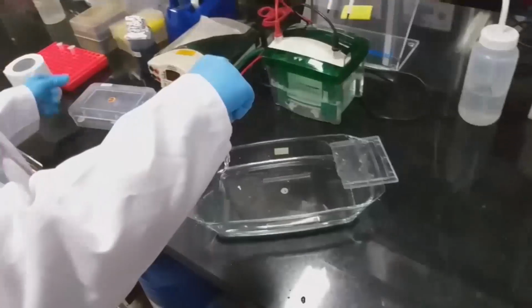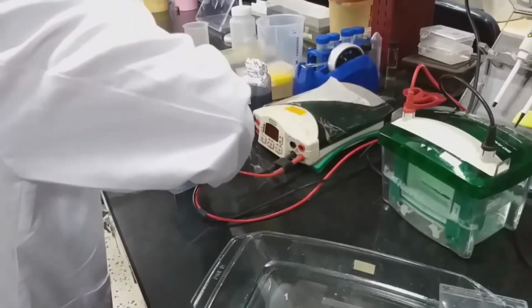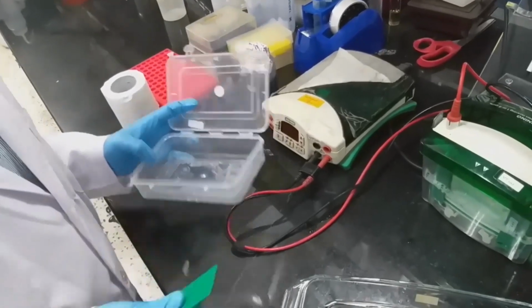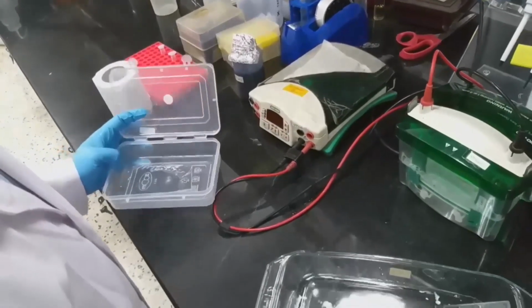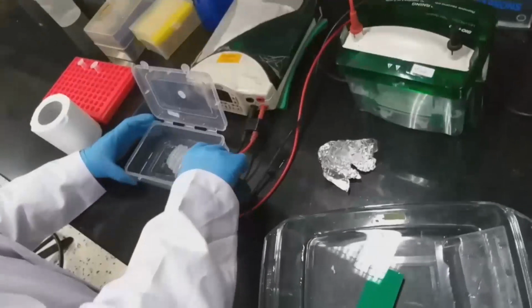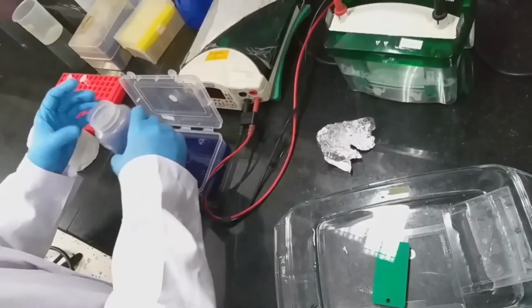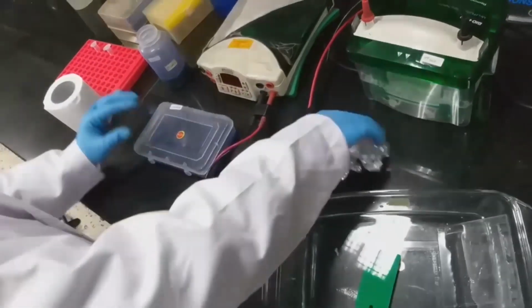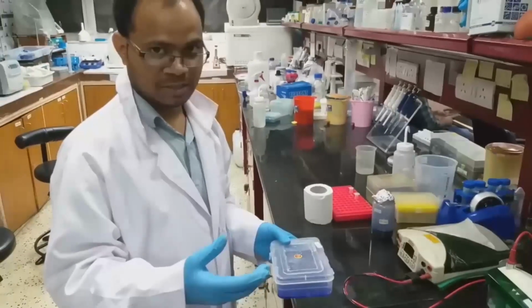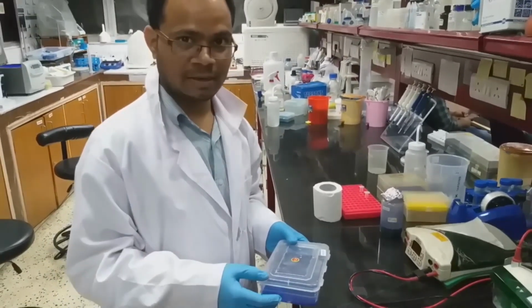So keep the gel in a staining box, which is more or less a plastic one, but it can sustain the solution. Then I am going to add staining solution. I will keep it for rotation on a shaker for at least 2 hours, then we will destain.